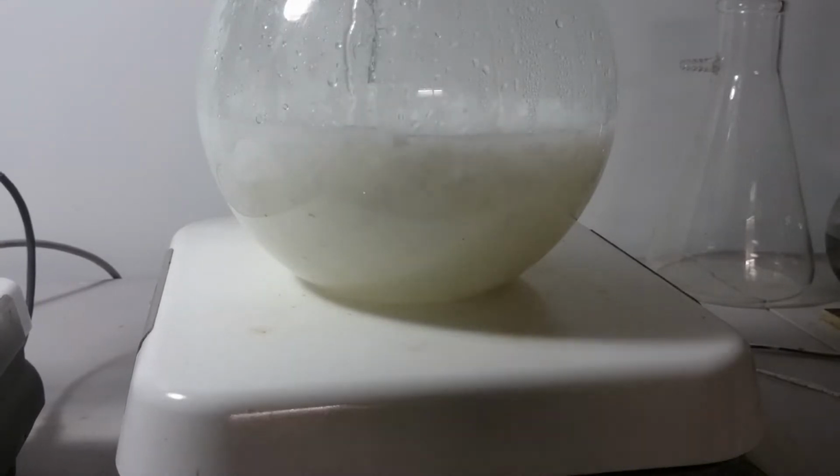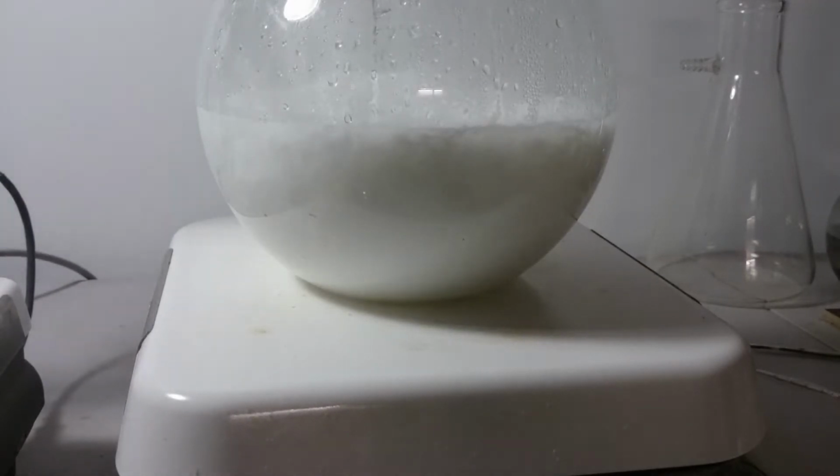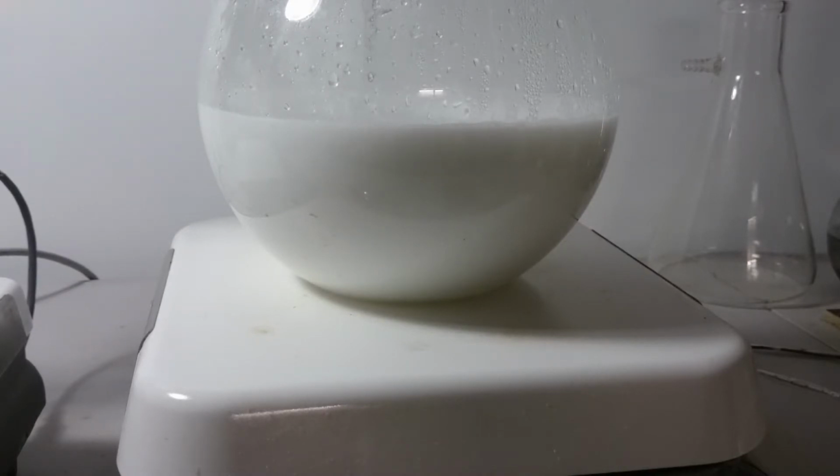When an ionic compound or salt is dissolved, it dissociates into positive and negatively charged ions. Take sodium carbonate for example. It breaks into positively charged sodium and negatively charged carbonate ions. These ions are then free to interact with ions of a complementary charge. In this case, the negatively charged carbonate from sodium carbonate can interact with the positively charged calcium from calcium propionate. This forms calcium carbonate, which is extremely insoluble in water and drops out of solution immediately. This drives the reaction to completion.